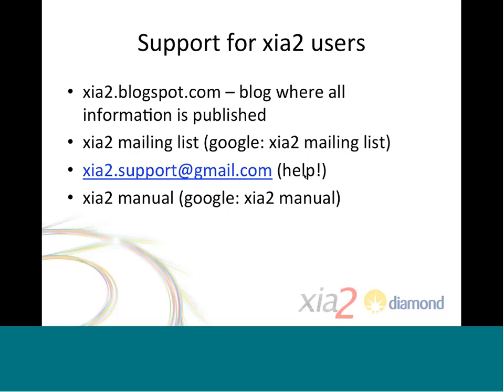I guess one thing which would be quite useful is if there's any additional information needed by Phenix or any other downstream analysis that I could have generated, then I should be able to pass that along, which I might be able to achieve. But I think focusing XIA2 on just the data reduction has helped XIA2 get on, and it also means that you're free to use one of these excellent tools that are out there for doing the automated structure solution.